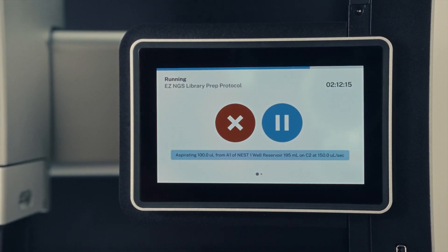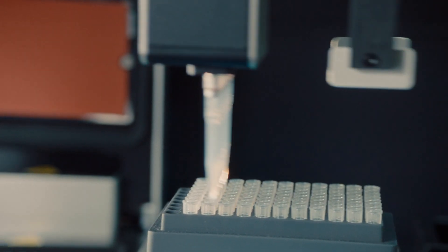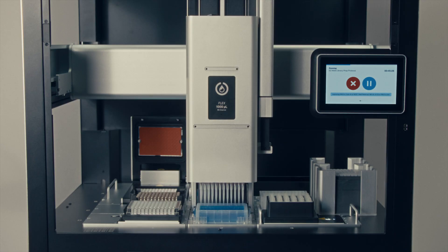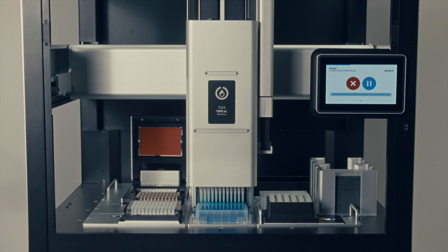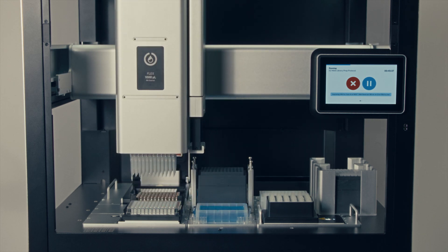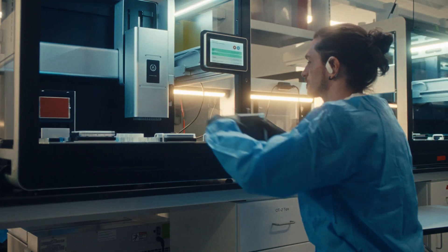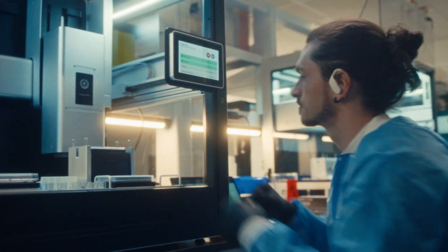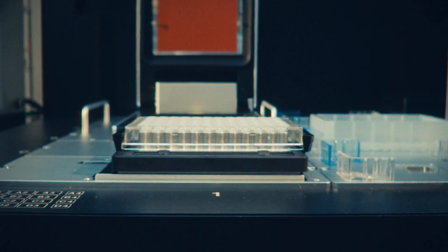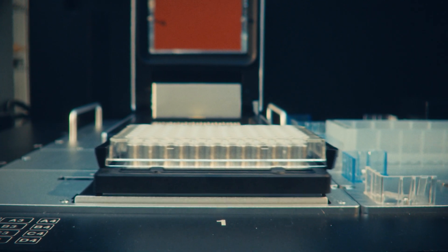The Opentrons Flex stretches your budget 10 times farther compared to competitive systems. If you look at the total cost of ownership including the cost of our hardware plus the cost of a support contract, we cost one-tenth the amount of other comparable systems on the market, and because of its incredible capabilities and value that it brings, we think that this is a bit of a flex on the automation market.